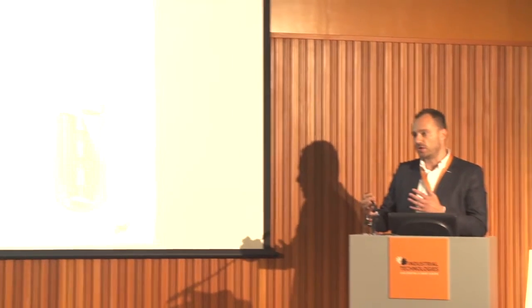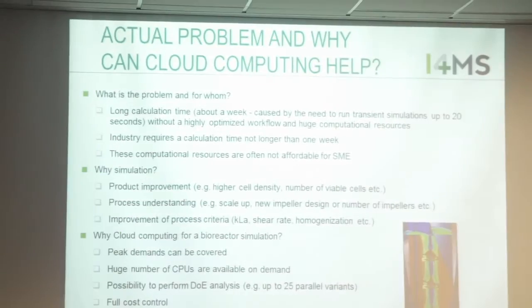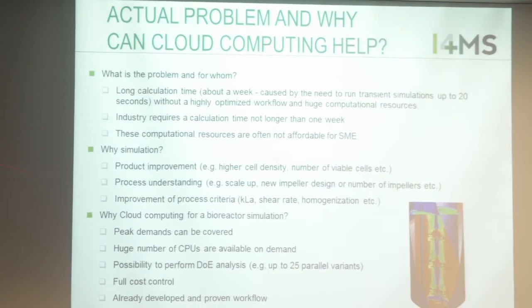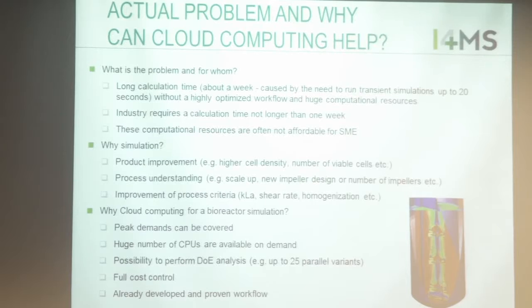And before I start with this presentation, I would like to answer three questions. What is the problem? The problem is that the bioreactor is usually customized. We have large scale, we have small scales, and manufacturers from the pharmaceutical and food industries are ordering customized bioreactors. The manufacturer has the problem with scale up, scale down. They come to simulation and ask, can you carry out this simulation and take a look at what's happening inside the bioreactor?